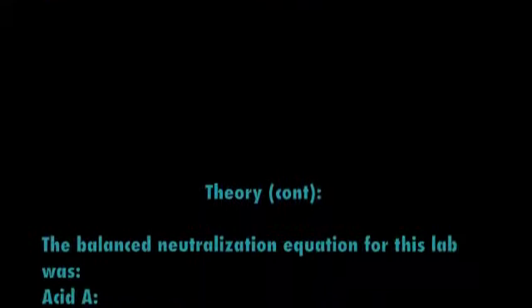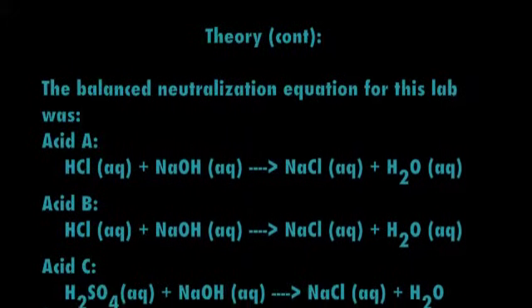Theory continued. The balanced neutralization equations for this lab are shown below.